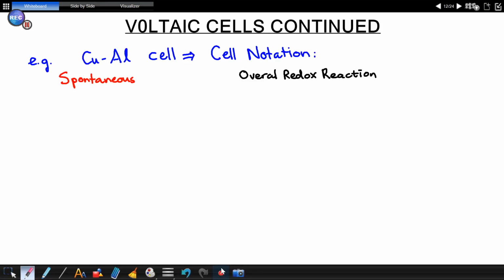So we are busy with voltaic cells, and one of the reactions that we did this morning was we placed a piece of aluminium into copper, and we saw that there was a change. There it is. This is what it looks like. You can see that the blue copper solution faded completely, and the aluminium was changed to form aluminium 3+ ions. So I could use those chemicals to build a voltaic cell.